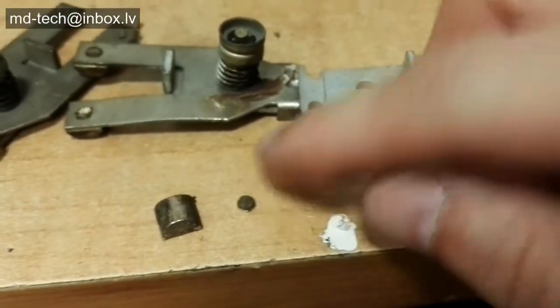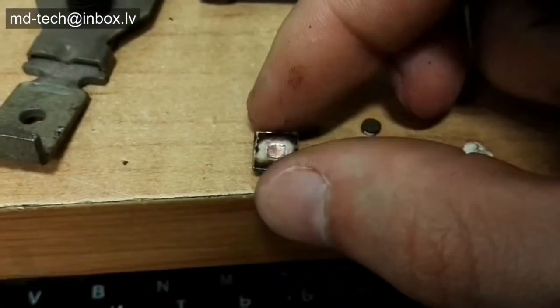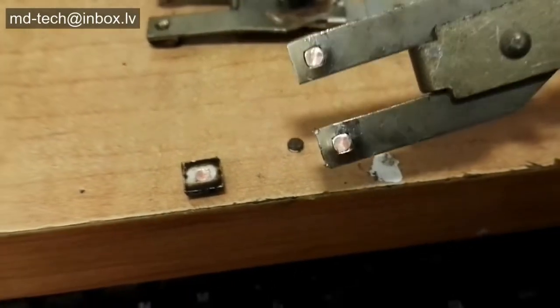I have electric contacts from a breaker. These contacts are not pure silver but only plated with silver. I need to remove the silver with minimum copper substrate damage — I want to re-use the copper in future. First I remove the silver contacts and wash with acetone to remove oils and dirt.